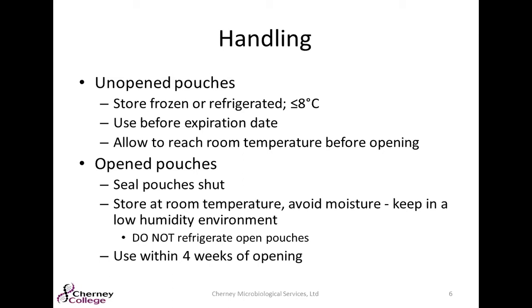For those open pouches, you're going to want to make sure that you seal the pouches shut after use, store them at room temperature, and avoid moisture. So make sure that you do not refrigerate those open pouches. You want to keep them in a low humidity environment, and use them within 4 weeks of opening, just to make sure that you use them within the optimal time range.